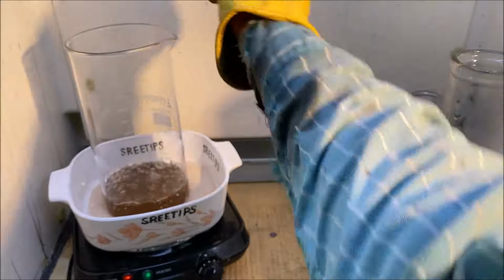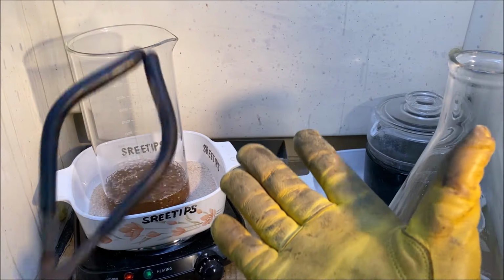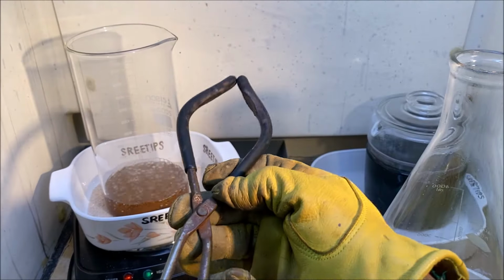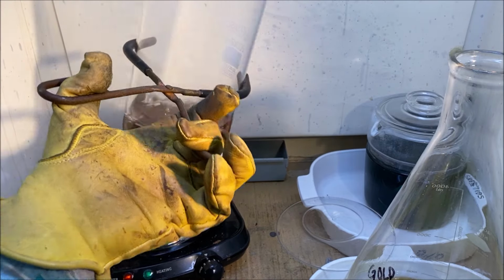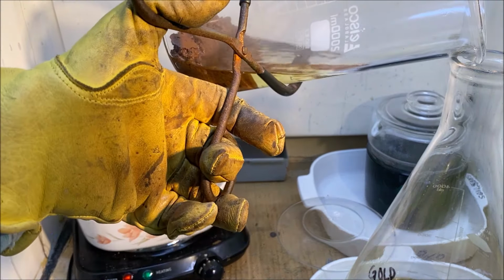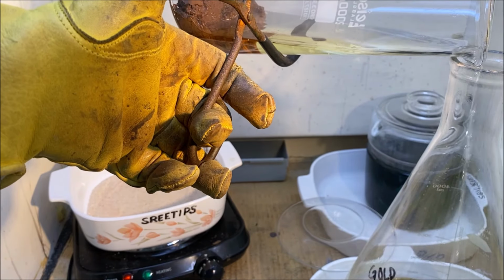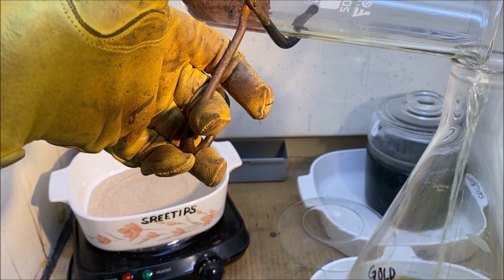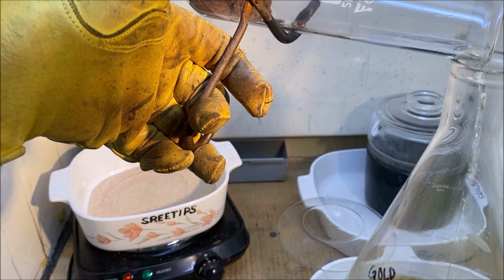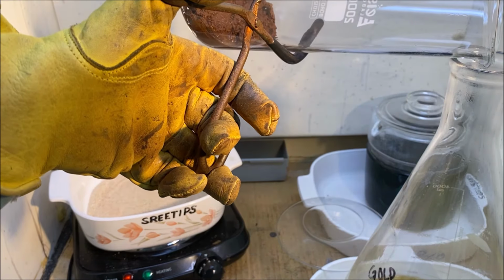Okay, this is the second hydrochloric acid boil. Someone had asked why I put gloves on like this, leather gloves. I just do it as a matter of convenience. Let's see, it's yellow still. So we've got some more rinsing to do. It's just a matter of convenience for me to put these rubber or leather gloves on as opposed to the nitrile gloves that I normally wear.